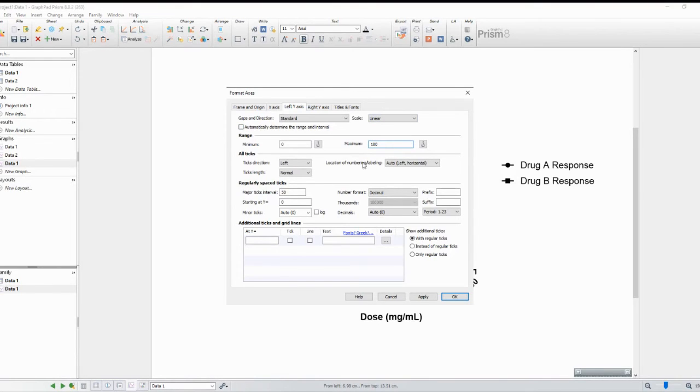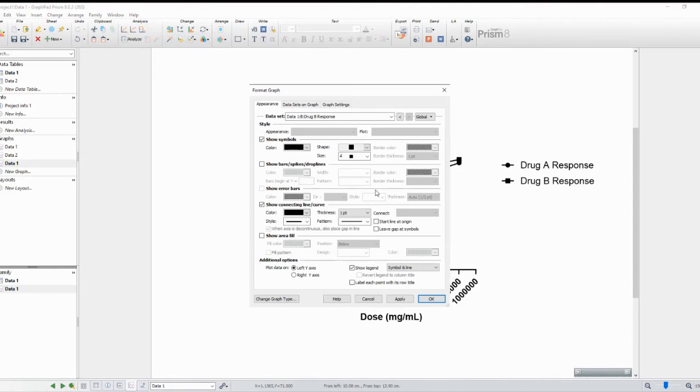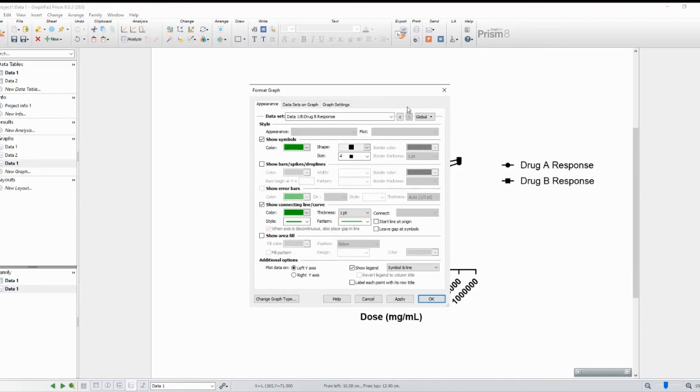That's it for today's tutorial on creating a dose-response curve using GraphPad Prism. Dose-response curves are essential tools in pharmacology and biomedical research, allowing us to assess the effectiveness of treatments and analyze concentration-response relationships.